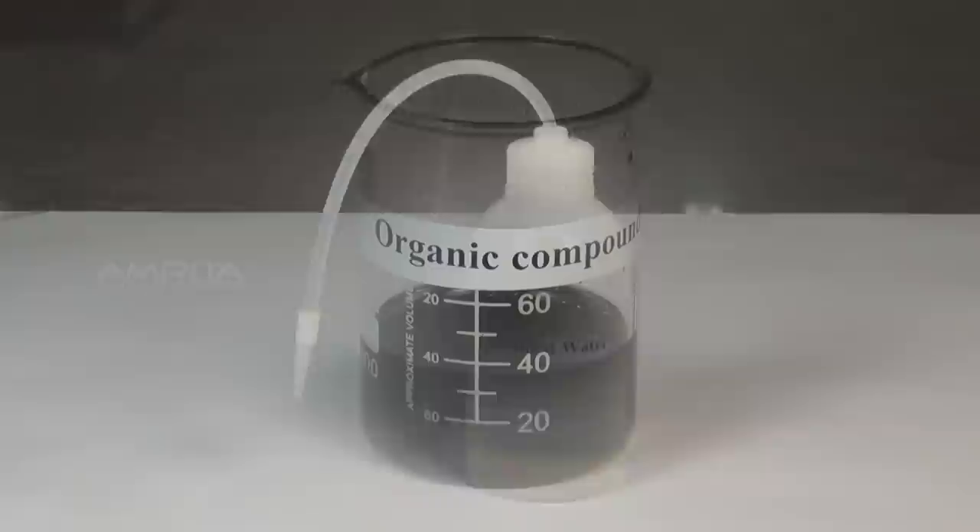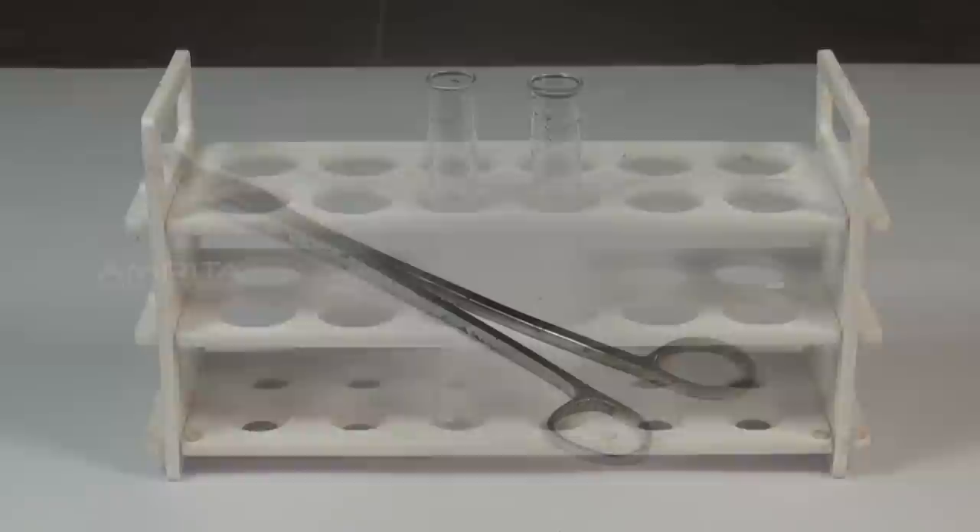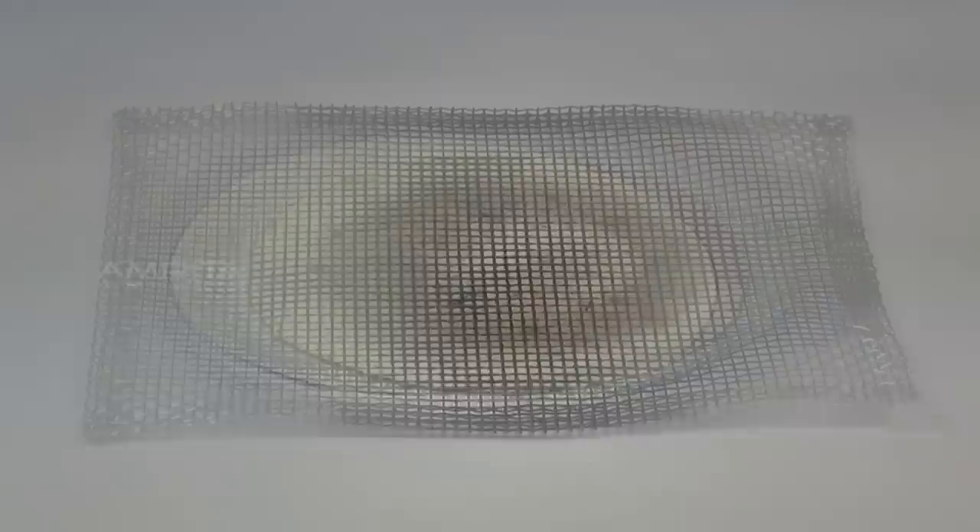Our aim here is to prepare the Lasagne's extract of the given organic compound. Materials required: sodium metal, distilled water, organic compound, forceps, fusion tubes, test tube, tongs, dropper, china dish, funnel, filter paper, wire gauze, tripod stand and Bunsen burner.